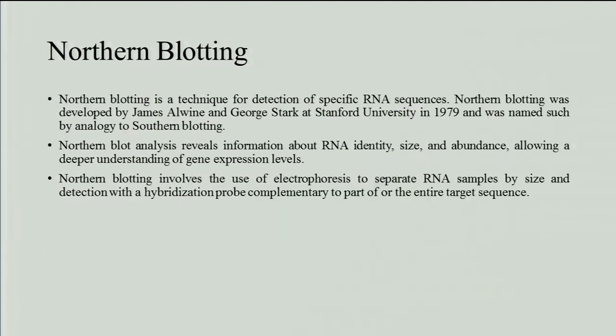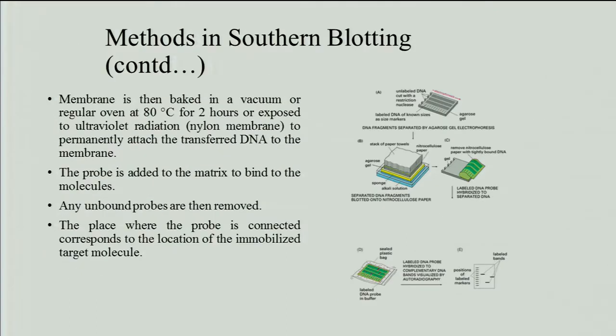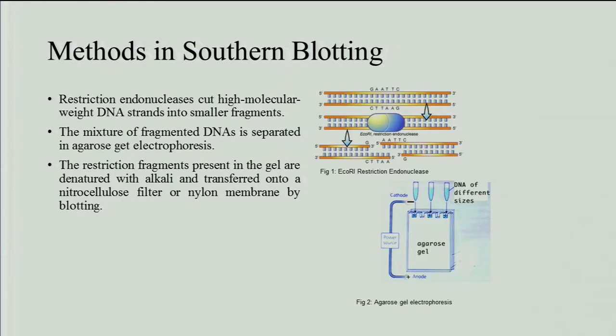So the RNA samples, the name of this process is known as electrophoresis, where you pass the thing through a voltage, and you would be hearing the word electrophoresis.